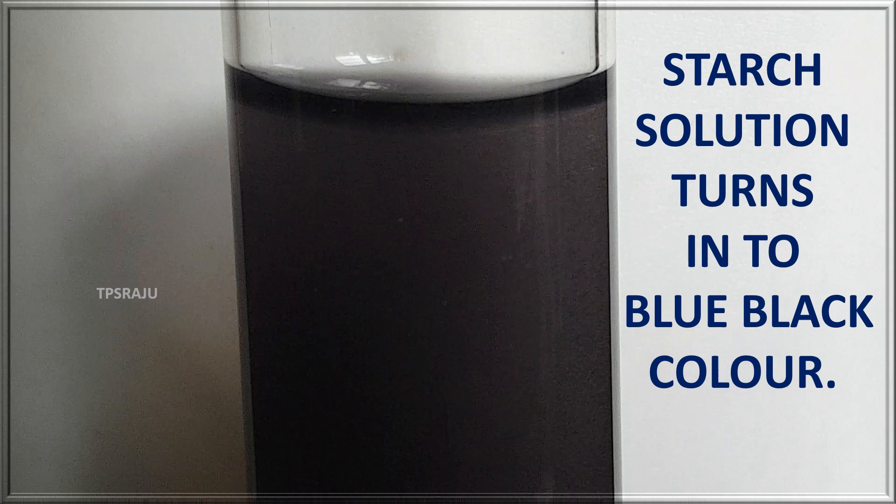Why does this occur? We already know that iodine solution is the starch indicator. Starch gives a blue-black color in the presence of iodine solution.